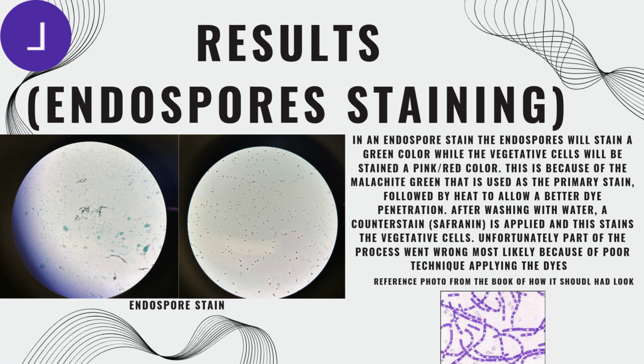But unfortunately, for this slide, we couldn't get the results that we wanted. Our main hypothesis is that it is because of our dyeing technique. We feel like it's not appropriate. It could also be the heat fixing, but we haven't done any more testing on it. But those are our two main hypotheses: the dyeing and the heat fixing technique.